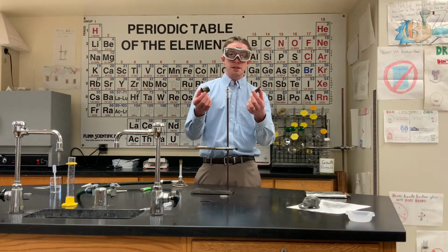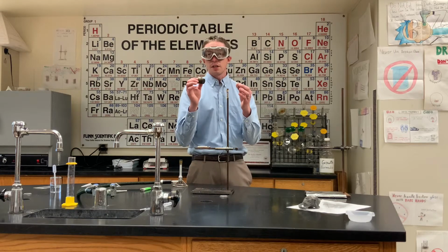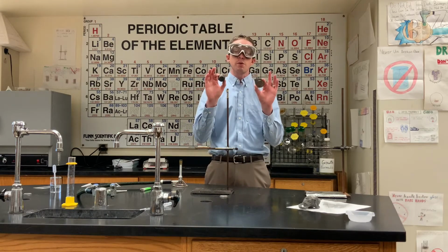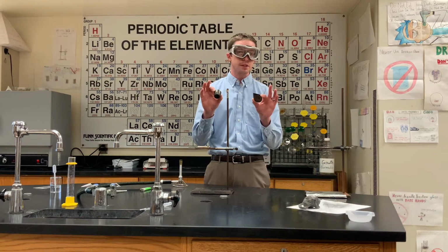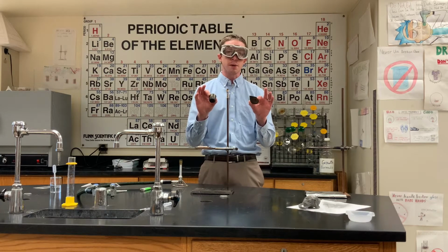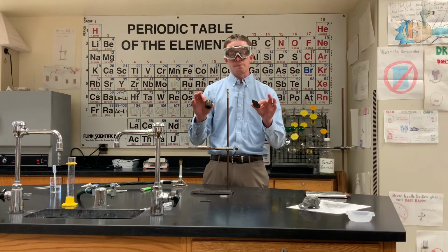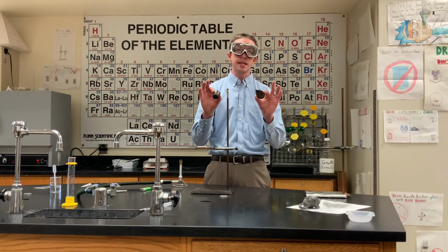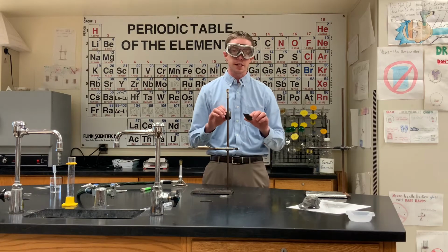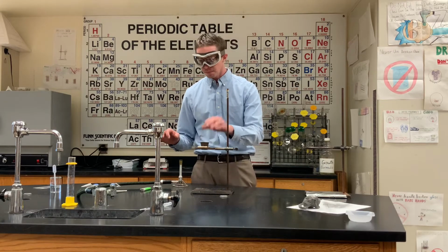You can tell I'm handling it with my hands, but the lab that we're about to take on is a very precision-oriented lab, and we want to make sure that this crucible is clean of any impurities before we begin. So the first step to this lab is going to be to burn off these impurities for about 5 minutes. So I'm going to fire up the Bunsen burner here, and we are going to heat it up pretty much as hot as we can for 5 minutes straight. And then after that point, I am no longer going to handle this crucible with my hands at all, because I don't want to transfer any dirt or oil from my hands to this crucible and somehow affect the mass of the experiment. So here we go.